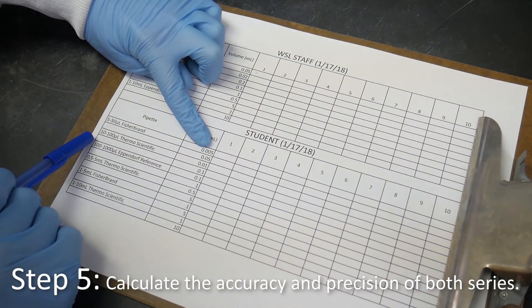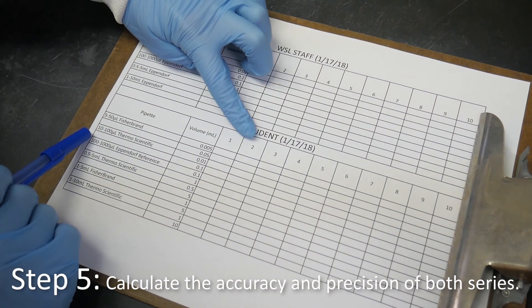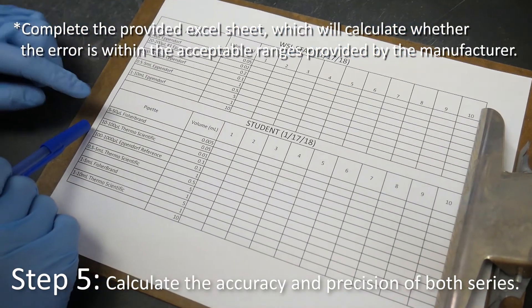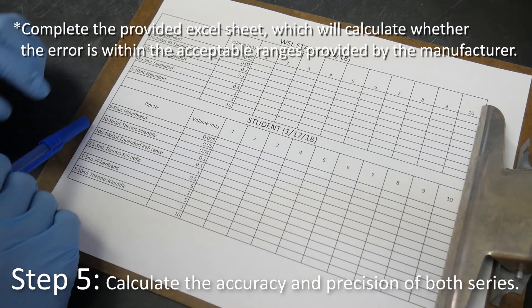Calculate the accuracy and precision of both series. Complete the provided Excel sheet, which will calculate whether the error is within the acceptable ranges provided by the manufacturer.